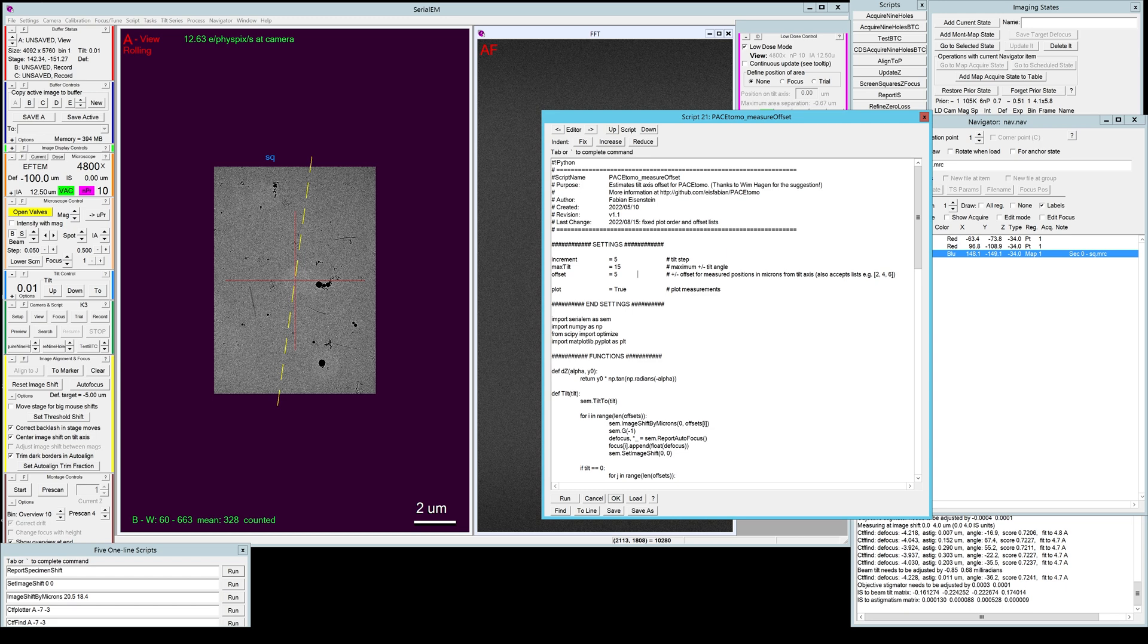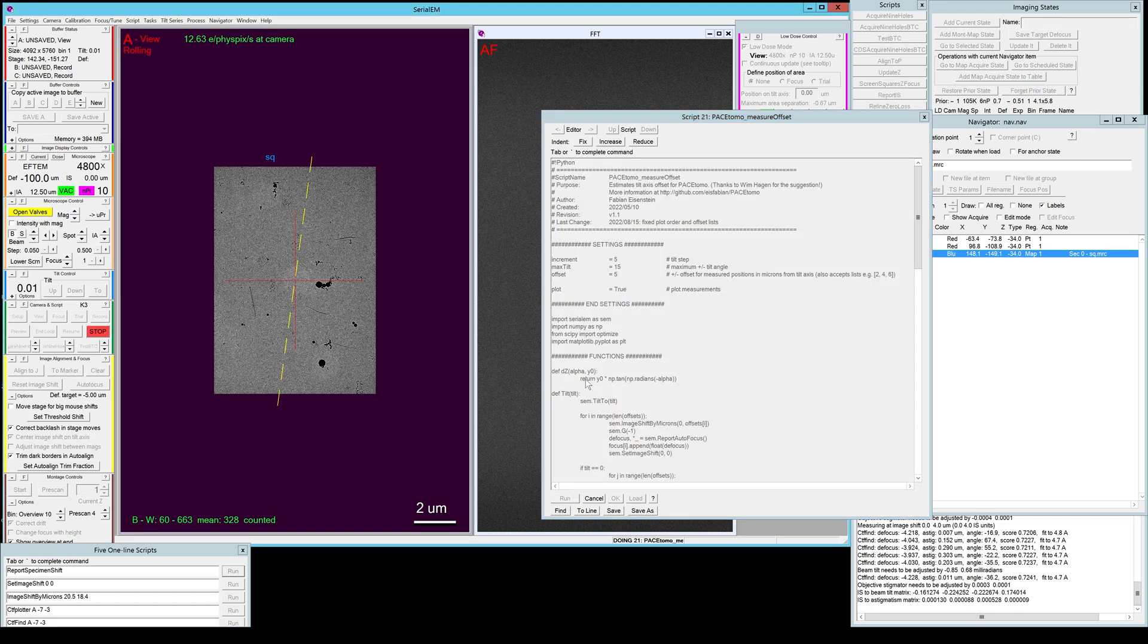But if you want to have more points to fit the final value, you can actually use a list of different offsets, like for example 2, 4, 6, and also you can have a different tilt angle range or finer increments to get more points. But I'll just run the default one.